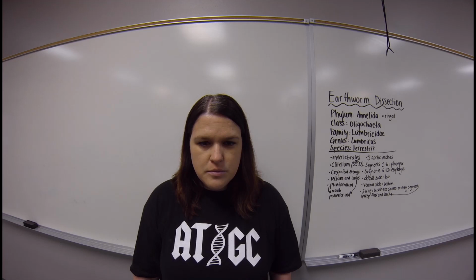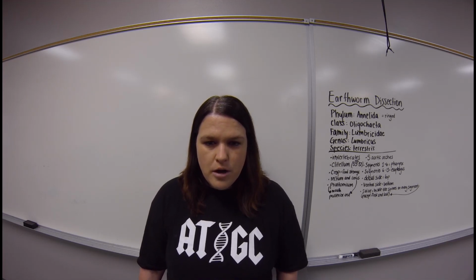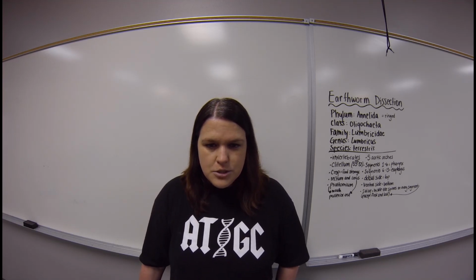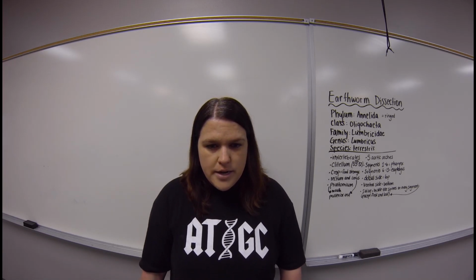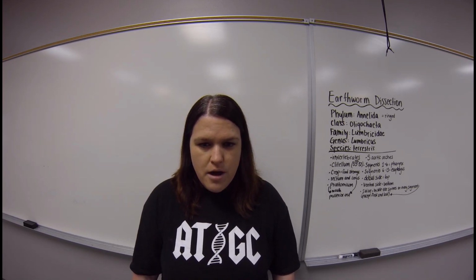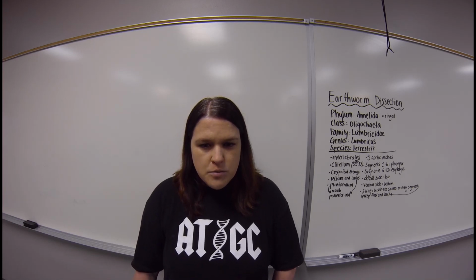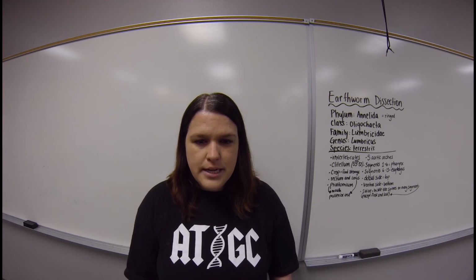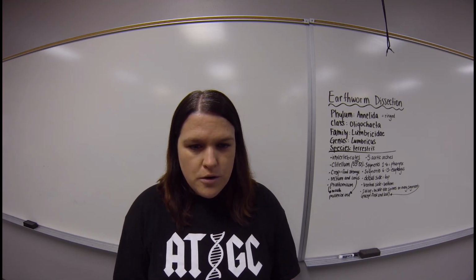The nervous system consists of the ventral nerve cord, which travels the length of the worm on the ventral side, and a series of ganglia, which are masses of tissue containing many nerve cells. The nerve collar surrounds the pharynx and consists of ganglia above and below the pharynx. Nervous impulses are responsible for movement and responses to stimuli. Each segment contains an enlargement, or ganglion, along the ventral nerve cord.